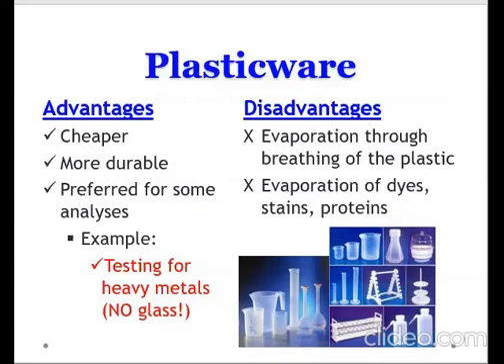Okay? When we talk about the cell membrane, it allows specific substances to diffuse or pass through its membrane. Same goes with your plastics. So there are substances that could easily diffuse in plastic.